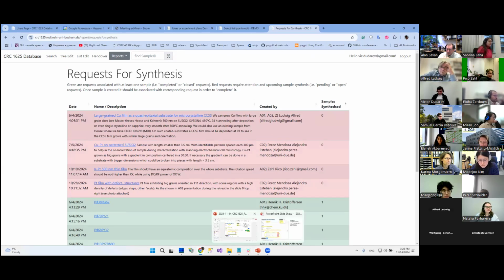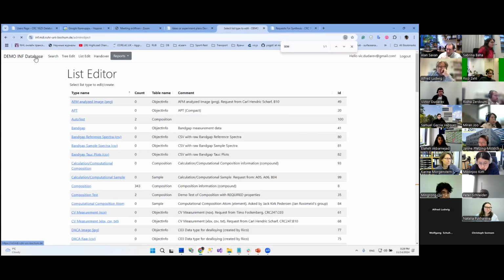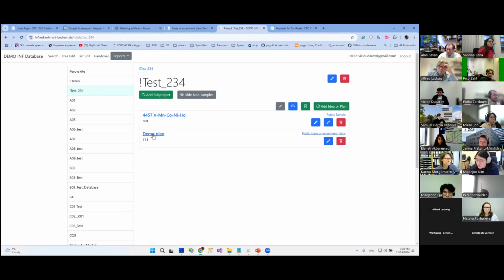Can you maybe create a request? Yeah, sure. It's fine. Let's create something. For example, maybe we can try to make something real. Many people are now in the group, and maybe there's someone who actually has a sample, and then we can actually do it in the real thing.